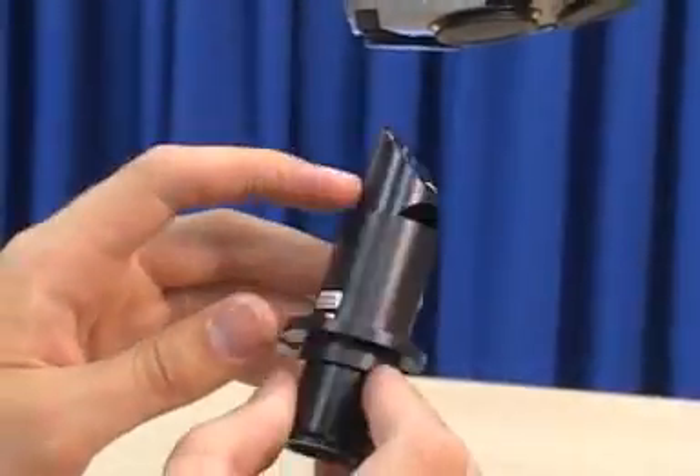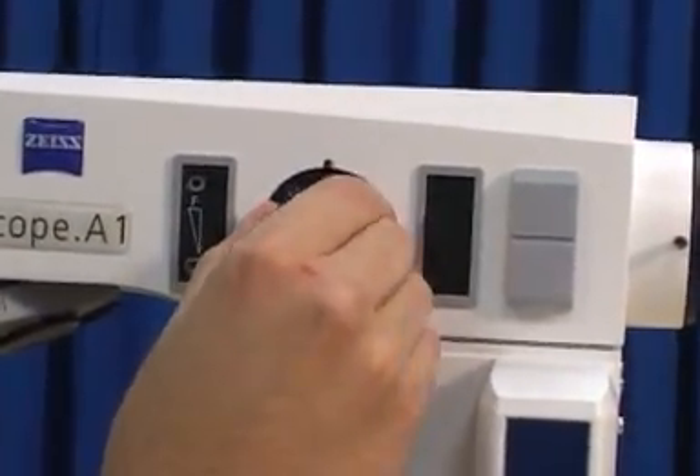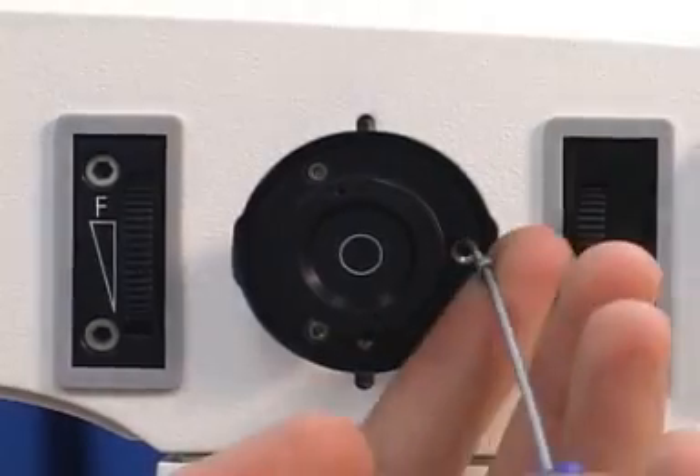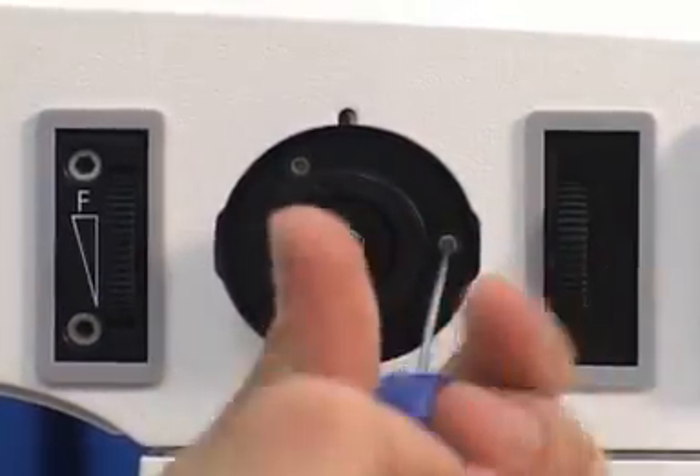Install the adjustment aid for the HBO 100 burner on the right-hand side of the upper part of the microscope. Do this by pulling off the solid cover plate, then insert the adjustment aid, fasten with three screws, and snap on the open cover plate.